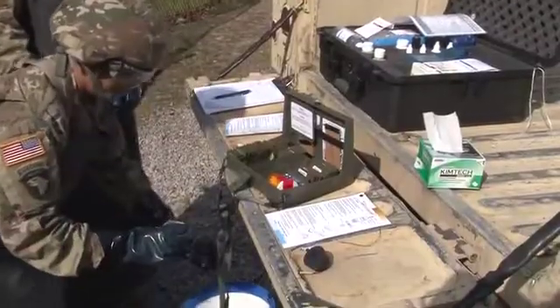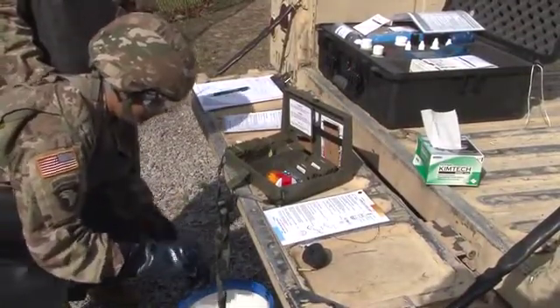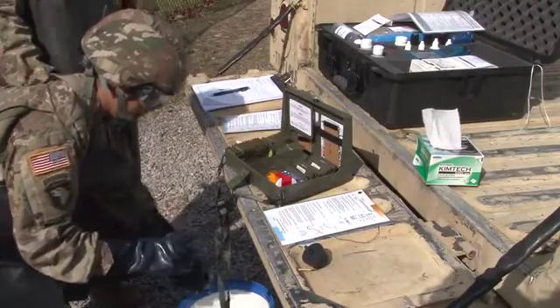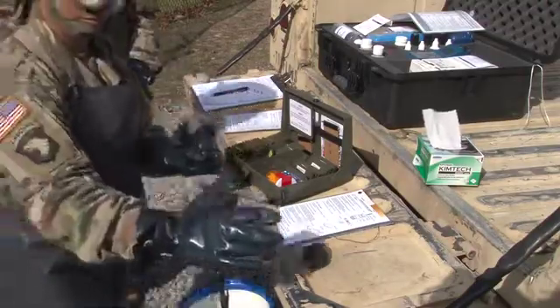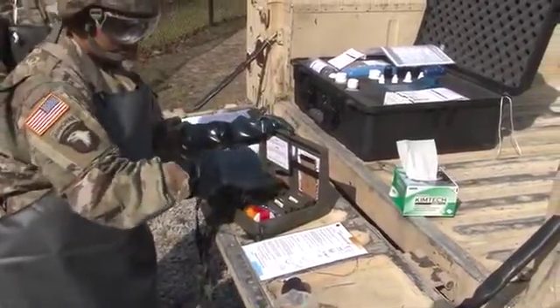Dispose of your water sample in accordance with local standard operating procedures. Rinse your used test hardware with potable water to be ready for the next test. You are done with test number 1, the LEWISITE test.